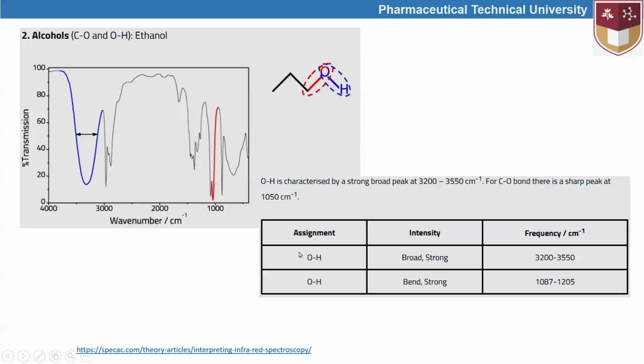I'm sorry, this is CO, not OH. It's actually wrong. OH is here, this belongs to 3,000.